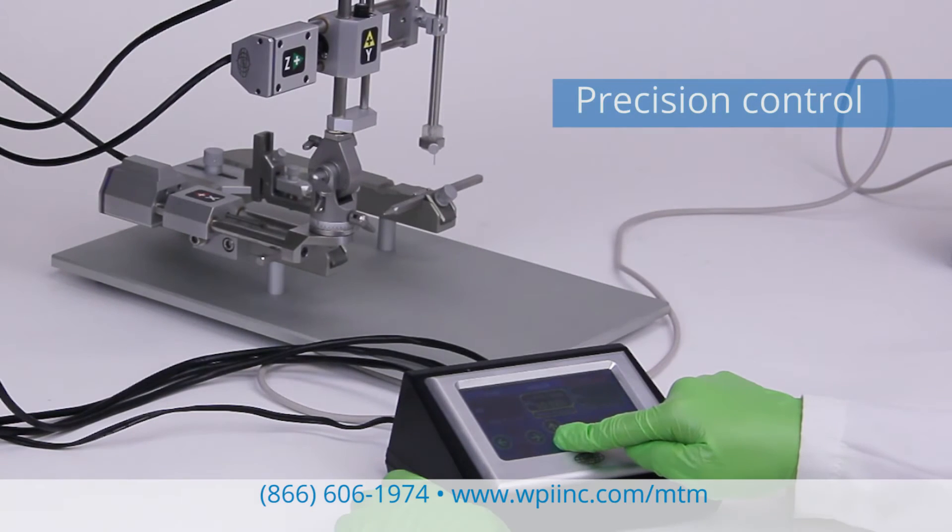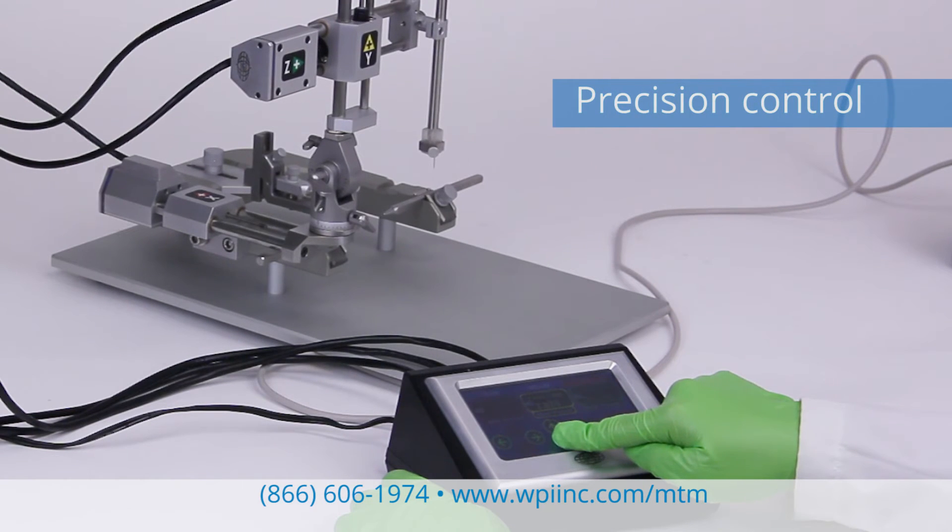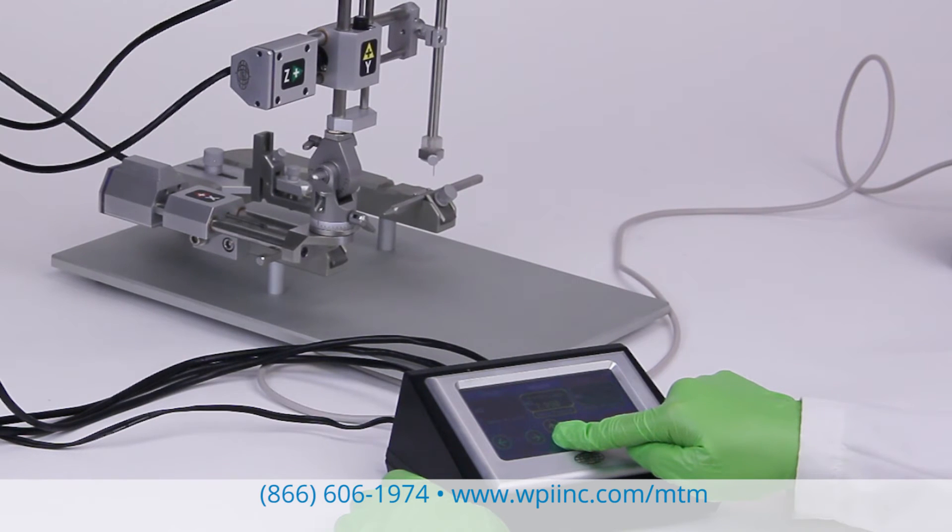The motorized axes of the MTM3 provide precise, controlled, three-dimensional placement of any probe or accessory.